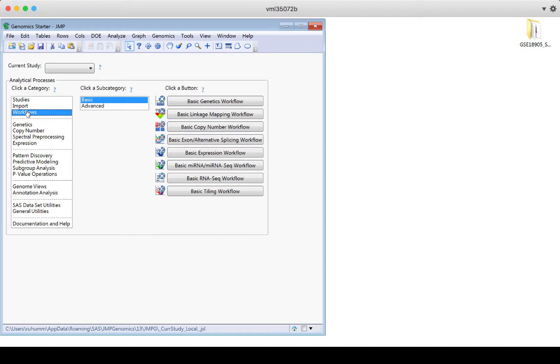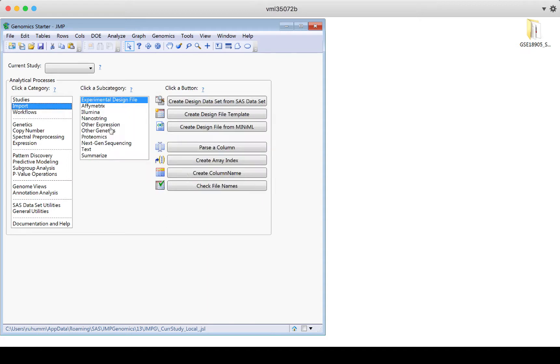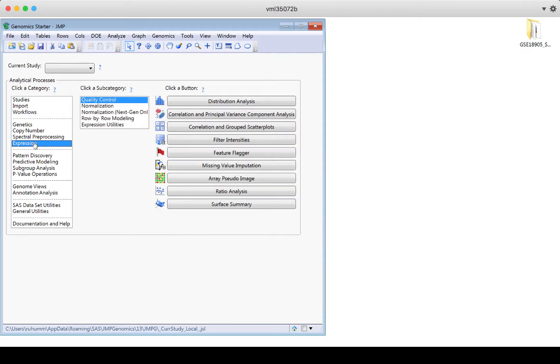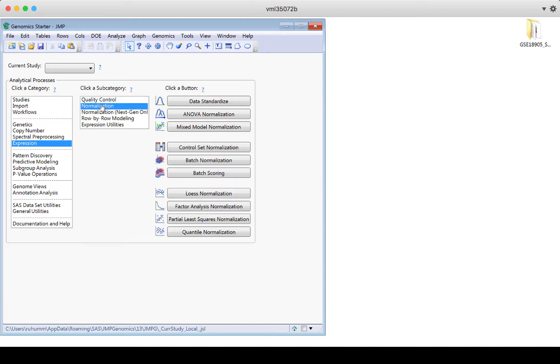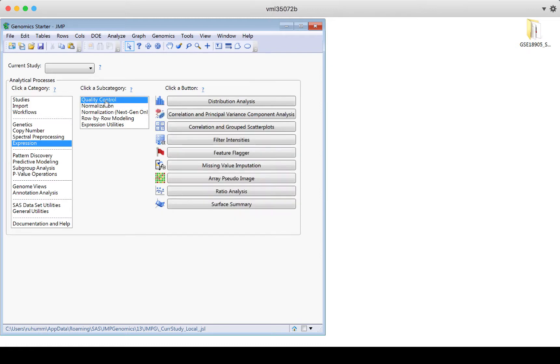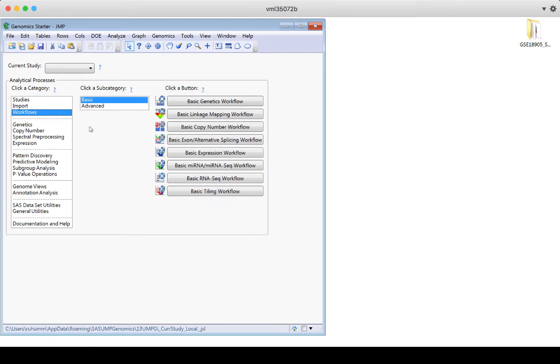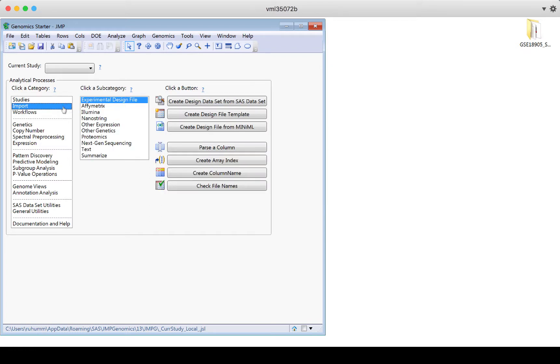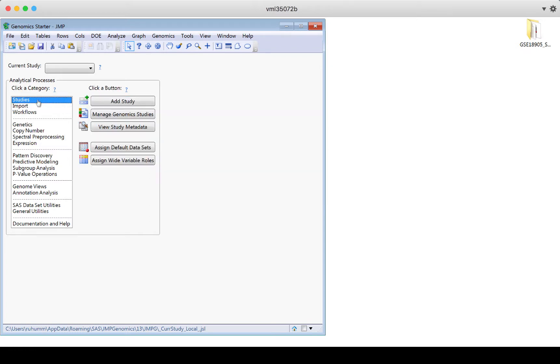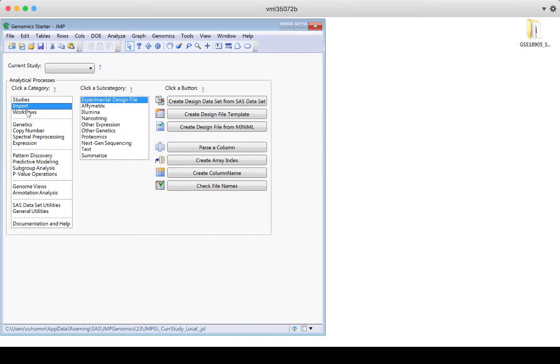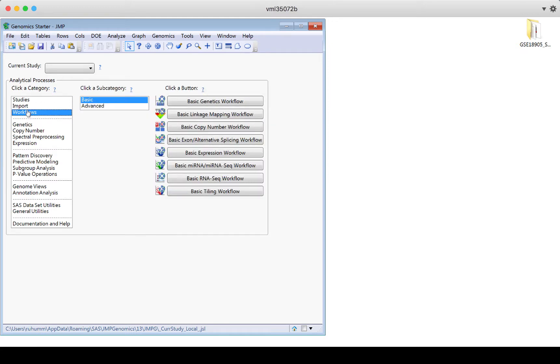For example, you could use import and then you might go down to expression. You might choose some quality control options and then choose to normalize the data, then rerun quality control options and so on. Some of those iterative things are actually going to be a part of the workflows. But when you're ready to make your own process, you can use the options down below. So for today, for this introduction to the genomic starter, we're really only going to talk about the studies, import and workflows as a quick overview because this is a great place to just get started.